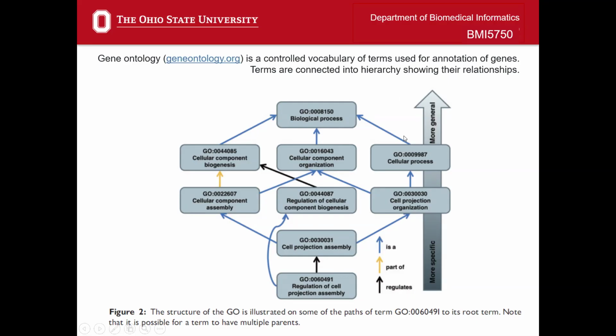You'll see positive regulation of coagulation and negative regulation of coagulation, and then you'll just see coagulation, which is made up of the positive and the negative regulation combined. So there is redundancy, there is hierarchy, so that some gene terms are completely present in a broader gene term. This is only true for gene ontology.